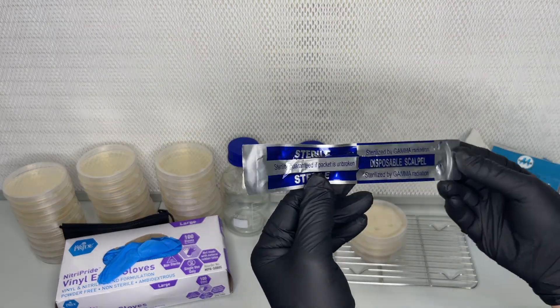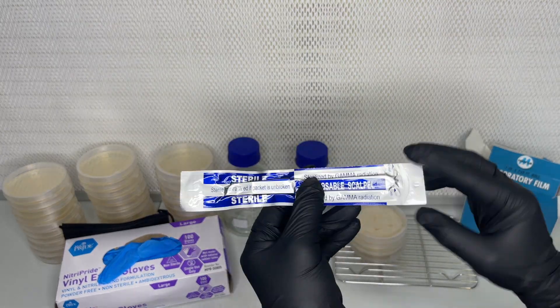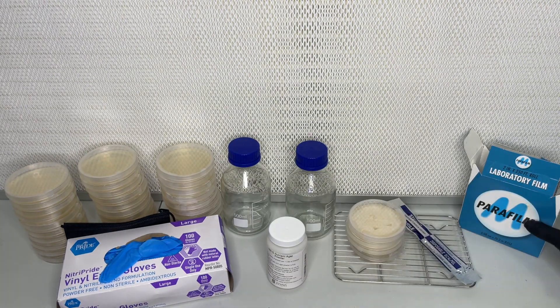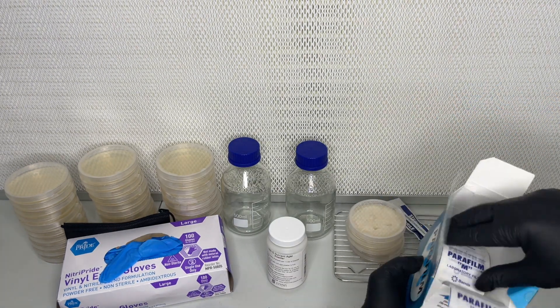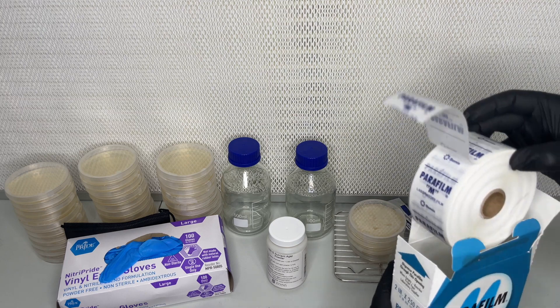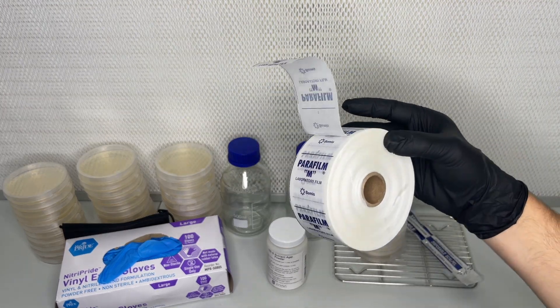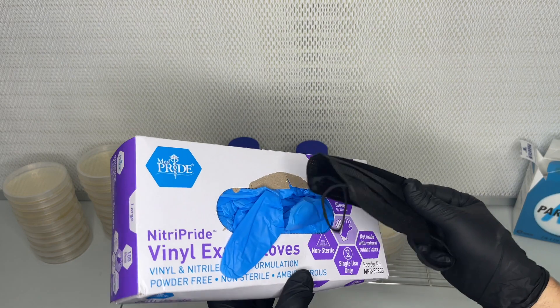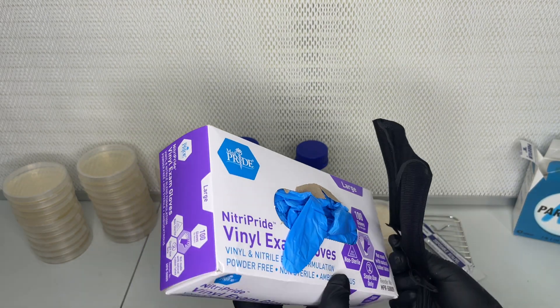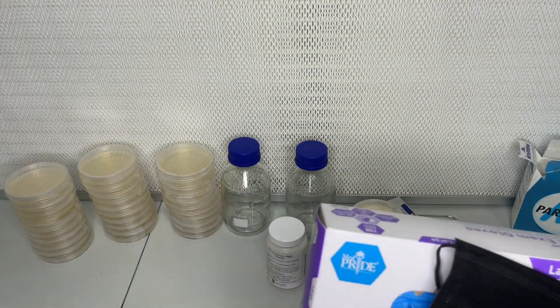I use these sterilized disposable scalpels to make my transfers on agar plates. I like the convenience and the assurance of clean transfers. I use that roll of parafilm to seal my agar plates after inoculation.